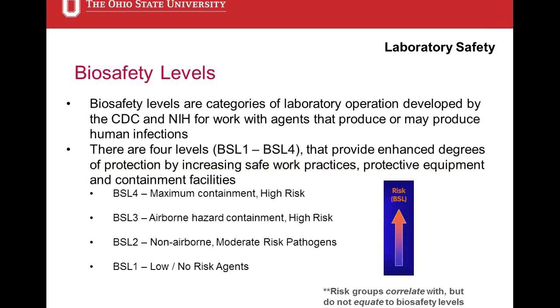Maybe you are working in a piece of equipment that aerosolizes that risk group 2 organism, and we just don't want to take the chance of creating so much aerosol that you might ingest it. So we want you to work in a BSL-3 lab where you might wear an N95 respirator. So we up the biosafety level.